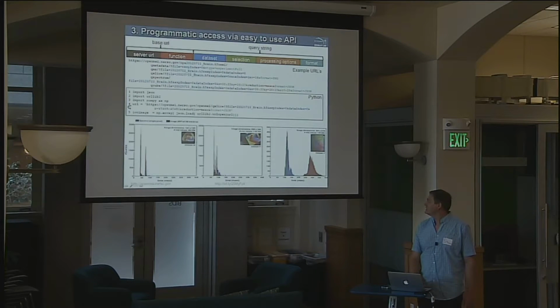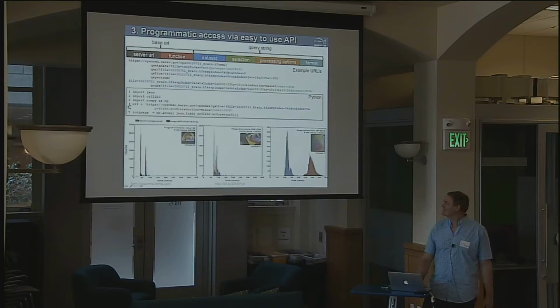Yeah, so we could get these large, for us this is a big image, hundreds of pixels by hundreds of pixels. But it has 130,000 mass bins, so it is kind of big in that dimension. And we're looking at millisecond timing to go from NERSC to a laptop and get these images and spectra.